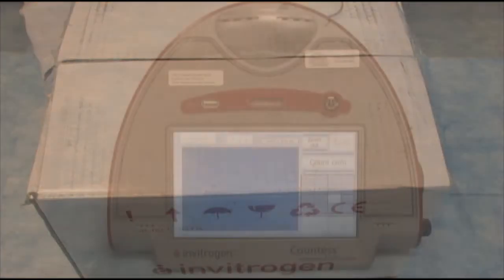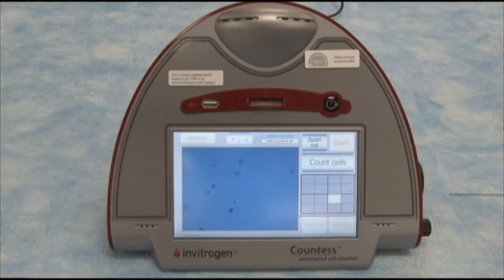To continue unboxing the Transfection workflow, we're going to unbox the Countess Automated Cell Counter.